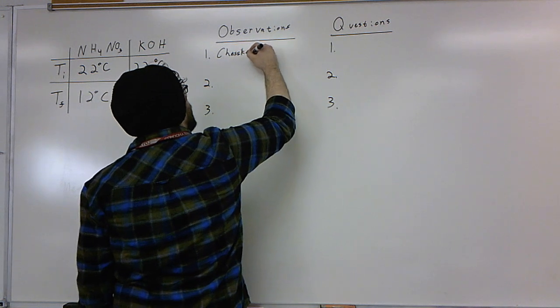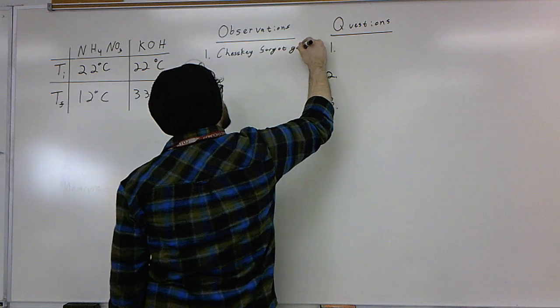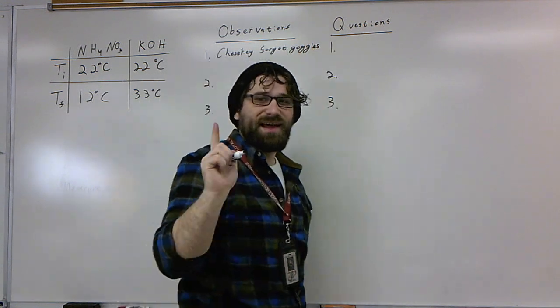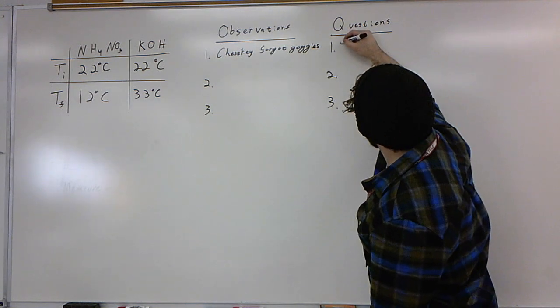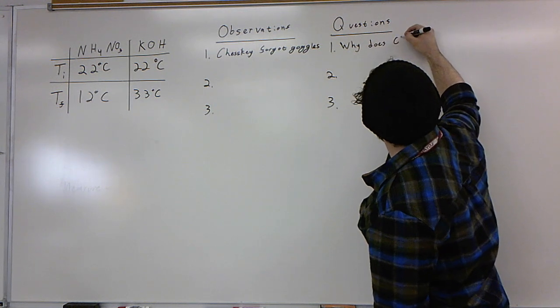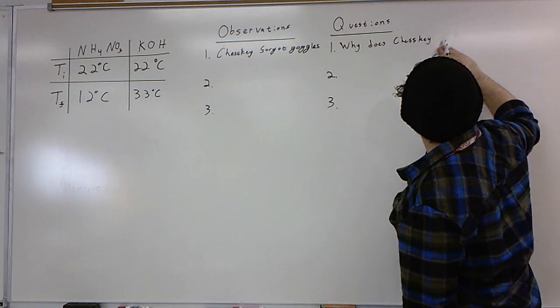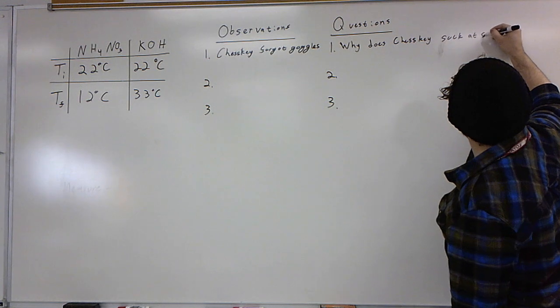Chesky forgot goggles. Hey, look at that. There we go. Now no one else needs to make that observation. A question could be something like, why does Chesky suck at safety?